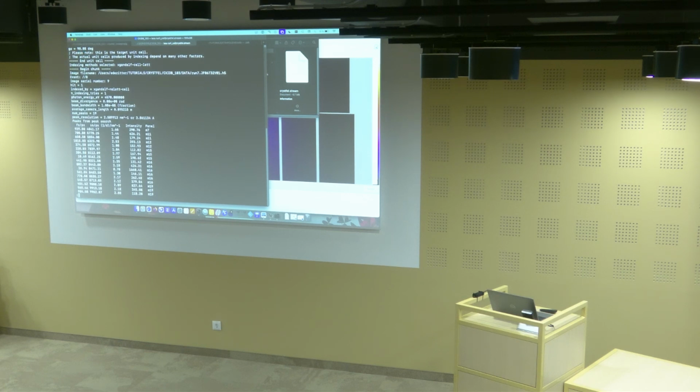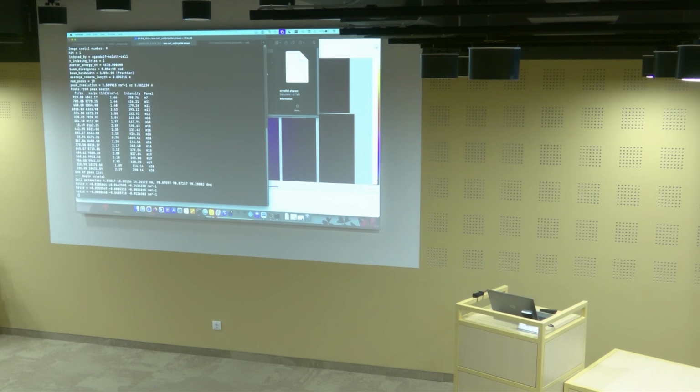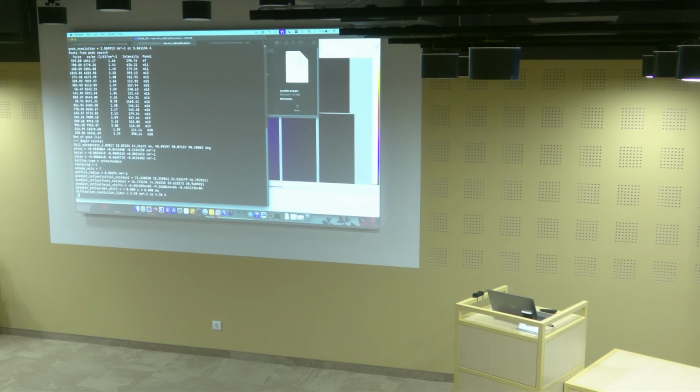Then we have information about the peaks that we found, so with the parameters that we set, so peak finder 8, a threshold of 55, and a signal to noise of 5. We found 19 peaks, and these are their locations. So after the peaks list, we have another begin something, which in this case is begin crystal. So we could find a crystal.